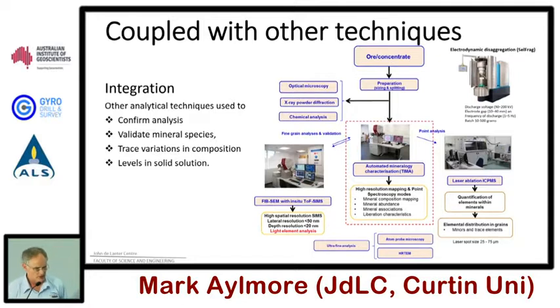Now, the important thing is not just the use of one technique, but in applications to look at utilising integration of different techniques. So if you have an ore or concentrate sample, in preparation, as Will mentioned, we've got a selFrag or electrodynamic disintegration technique, which can liberate particles without ending up with lots of fines or breaking up, and keeps the integrity of the minerals, which tends to be lost when you crush it. Use standard techniques of optical microscopy, X-ray diffraction, and chemical analysis for bulk analysis.